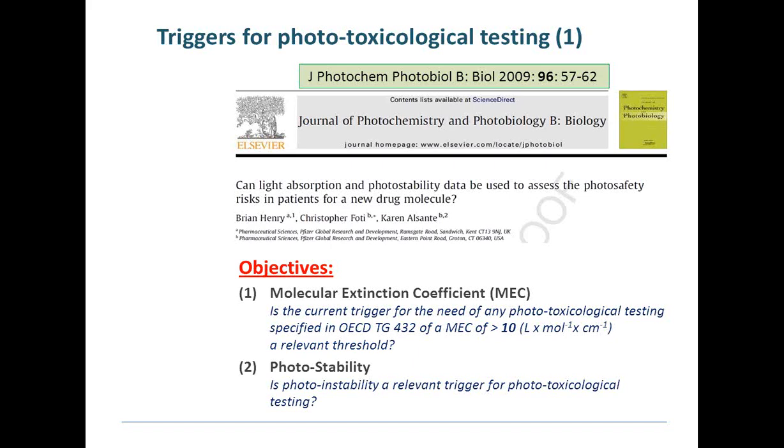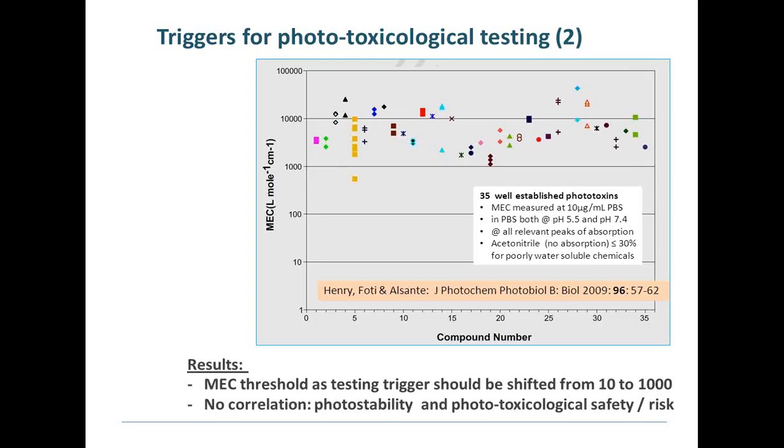One, to check the molecular extinction coefficient compared to 3T3 results, other in vivo and in vitro results, and all knowledge about phototoxicity in humans. The other was using data on photostability, that is the physicochemical stability when a material is irradiated, to see whether this is a good trigger.